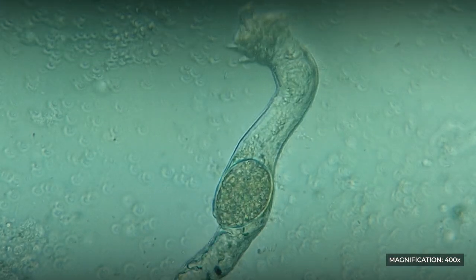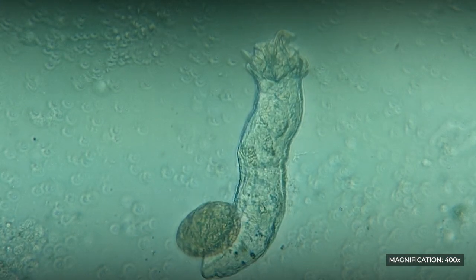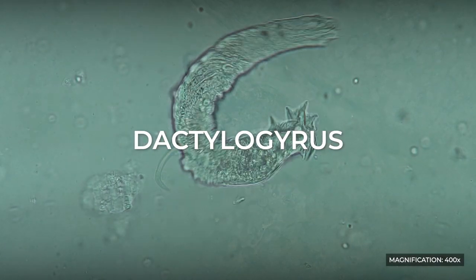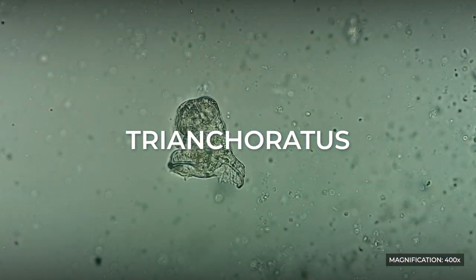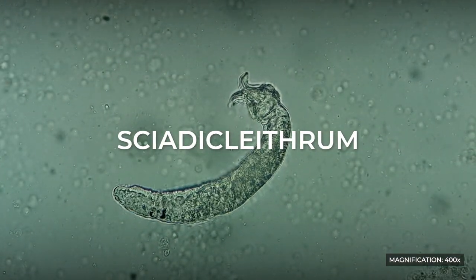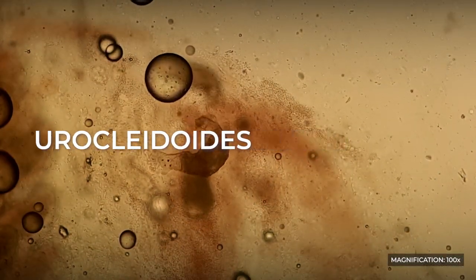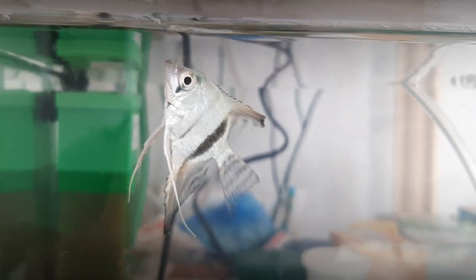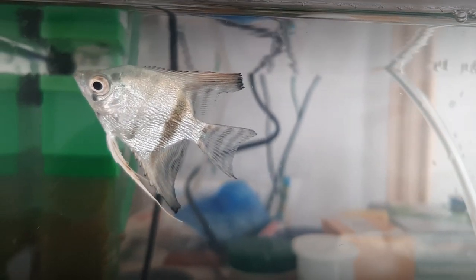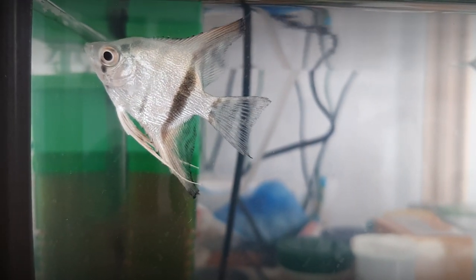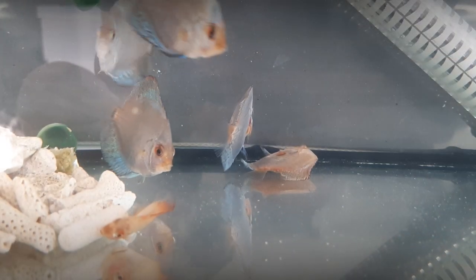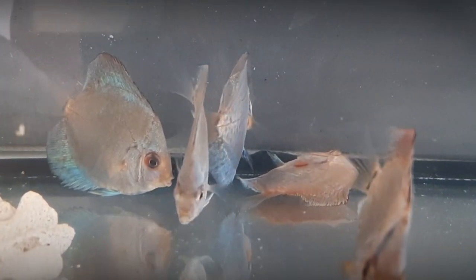In contrast to viviparous skin flukes, gill flukes are egg-laying parasites. Gill flukes belonging to different genera — Dactylogyrus, Trianchoratus, Sundacleidus, Urocleidoides, Diclebothrium — differ in size and in the structure of their attachment disc. All gill flukes cause respiratory problems in fish. Infected fish exhibit widely open gill covers, rapid breathing, and become either lethargic or stressed. Gill flukes pose a significant danger to young fish and often lead to mass mortality.